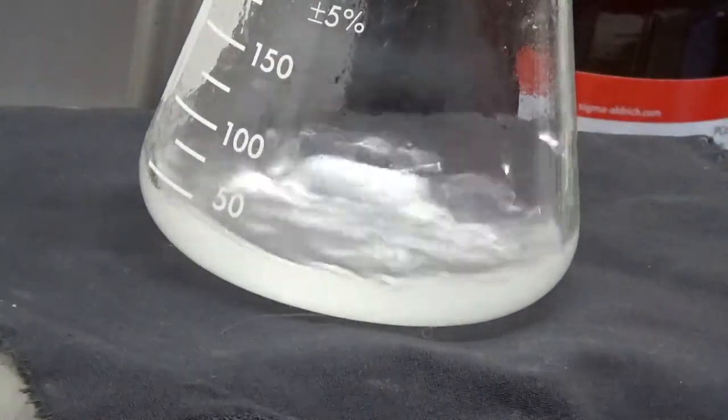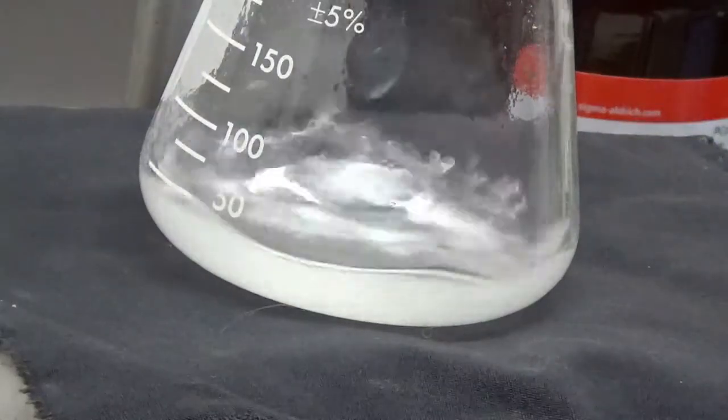But I don't think I have to put much more than a milliliter for this first one. So let's be careful. Get my eyes acclimated again. That's enough.